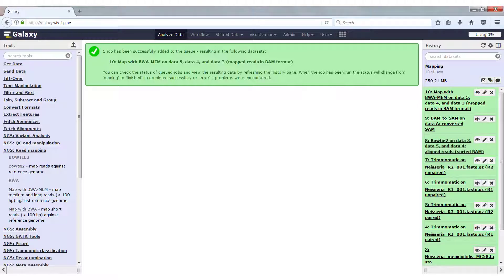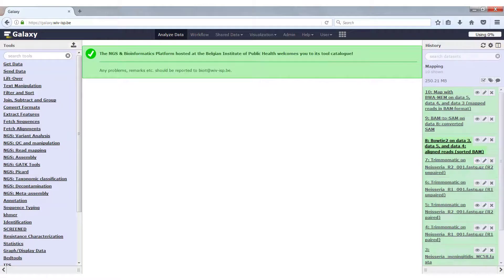The run is finished. You can see that again we have one output file in the BAM format. If you want to convert it to something human readable, you just convert it to SAM. Now that we have our mapped reads, we can continue our analysis of the data, because mapping the reads on its own doesn't give us the information that we want. So we just click analyze data and continue our analysis.